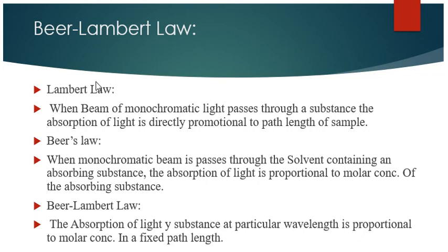It states that when a beam of monochromatic light passes through a substance, the absorption of light is directly proportional to the path length and is directly proportional to the molar concentration of the absorbing substance. So with an increase in the path length, that is, if the beaker containing the solvent is increased in width, then the light covers a greater distance in the solvent.